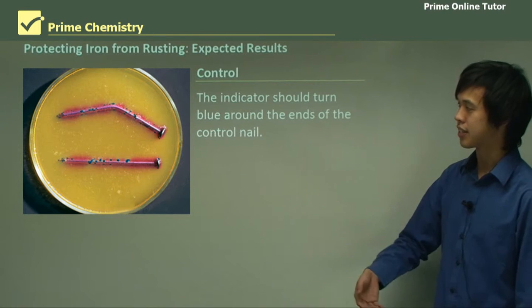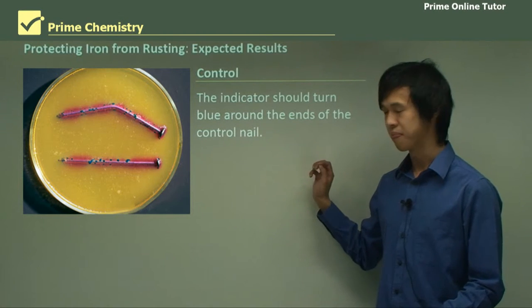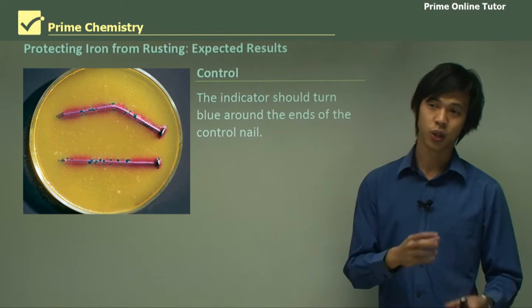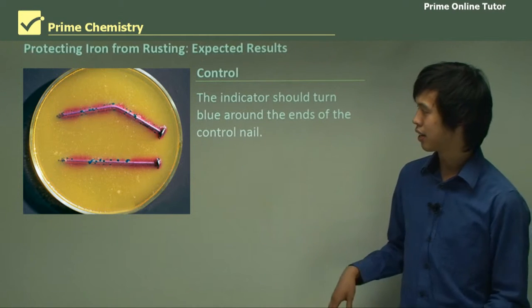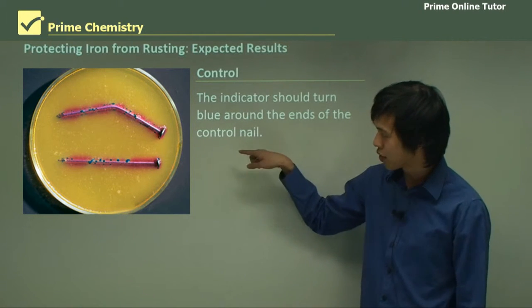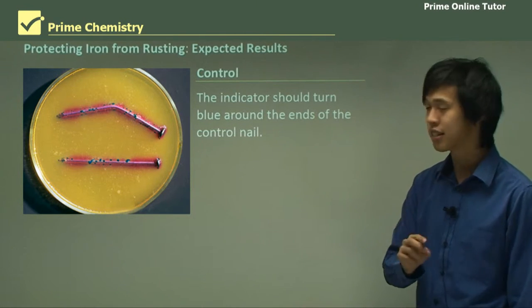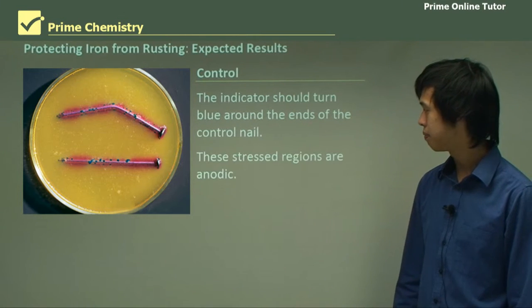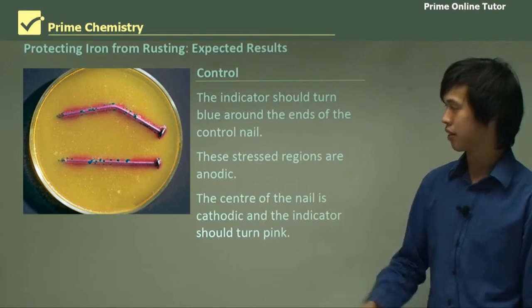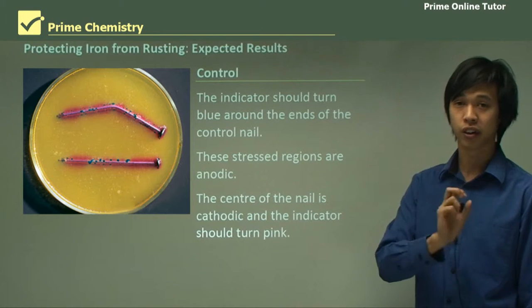So the control — this is what we're likely to see. The reason why it's yellow is because it's in agar; I did a similar prac at university. This could just be ferroxyl indicator — don't worry about the yellow. As you can see, the ends and these blue points, there are little blue dots. They're anodic sites and stress sites — the most stressed sites in the iron nail. The center of the nail and the surrounding regions are cathodic, and the indicator turned pink. Those sites are cathodic and they've turned the water and oxygen into OH⁻.